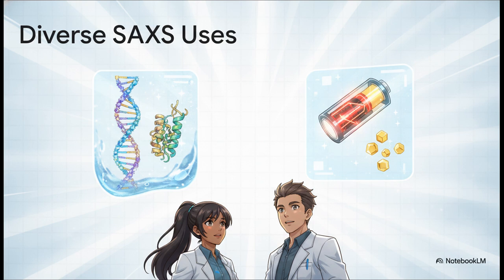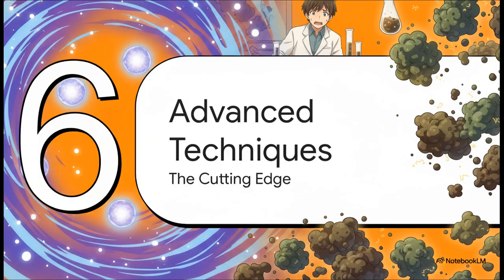Meanwhile, over in materials science, researchers are using SAXS to characterize gold and silica nanoparticles, investigate domain sizes in polymer blends, and optimize the porous internal structures of catalysts, fuel cell components, and advanced battery materials. It's everywhere.